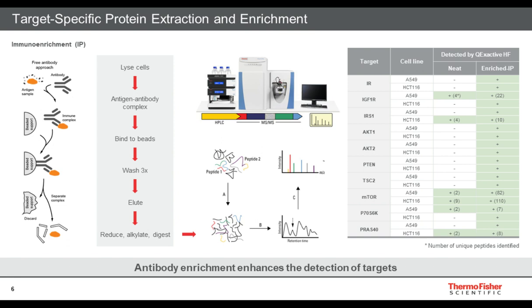And these peptides are further separated by liquid chromatography based on the hydrophobicity. And as each peptide elutes off the column, it gets further fragmented, and that generates the fragment spectra for each peptide. And this spectra is matched against the theoretical spectra to identify the peptide sequences.